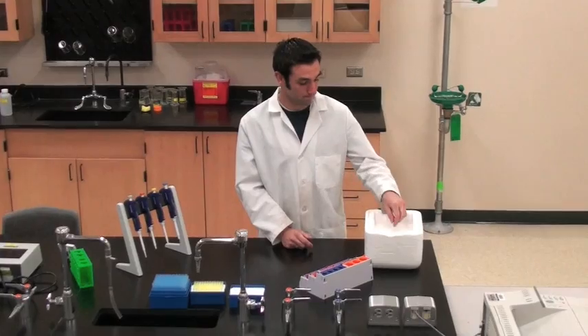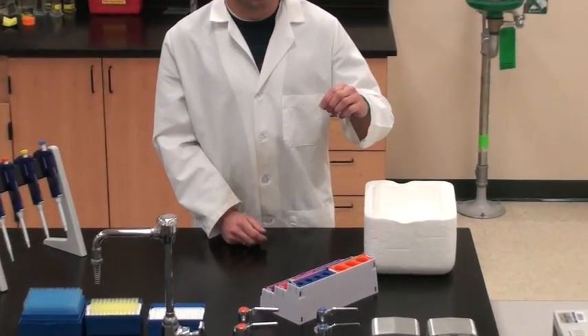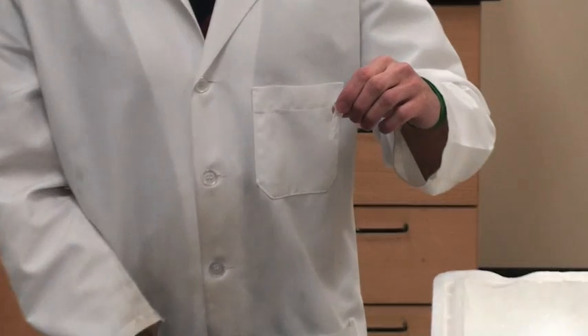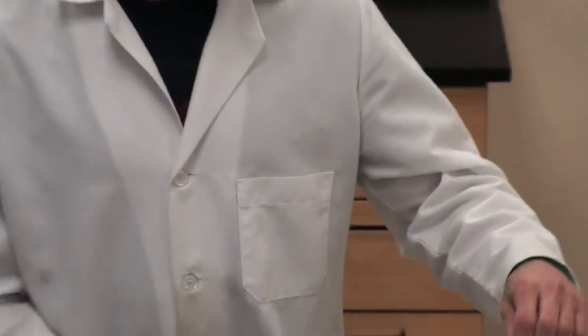Your instructor should provide you with competent E. coli cells. Competence of a cell relies on the ability to take up extracellular DNA from its environment. This should contain 60 microliters of bacterial solution.